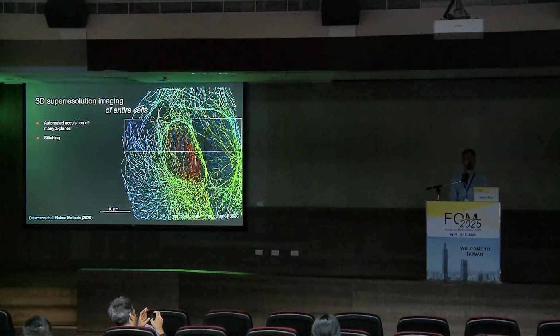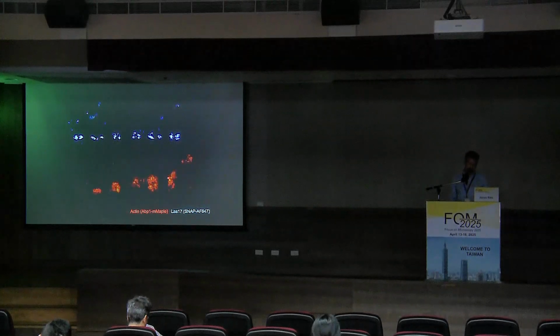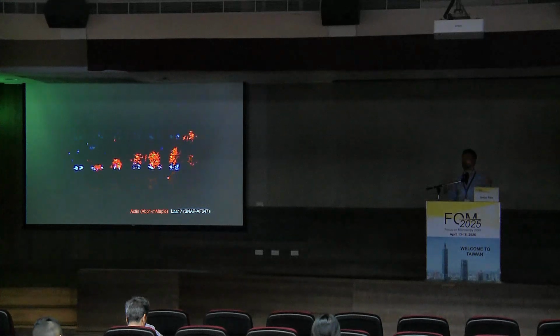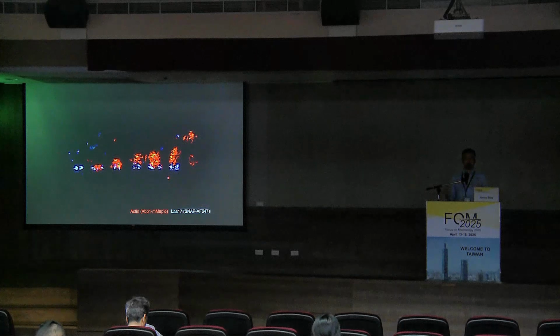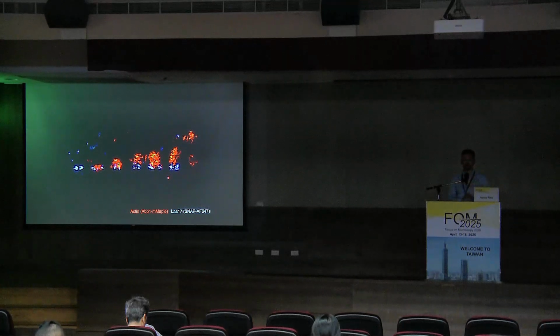So this was 3D, now multicolor. If we look only in a single color, we typically learn much less about the target structure than if we can do it in 2 colors simultaneously, because then we can directly relate different molecules to each other and their relative arrangement. Now there are many ways of doing multicolor super resolution microscopy. We can do it sequentially, as in DNA paint, or by using 2 spectrally very different fluorophores that blink and can be activated at different wavelengths.